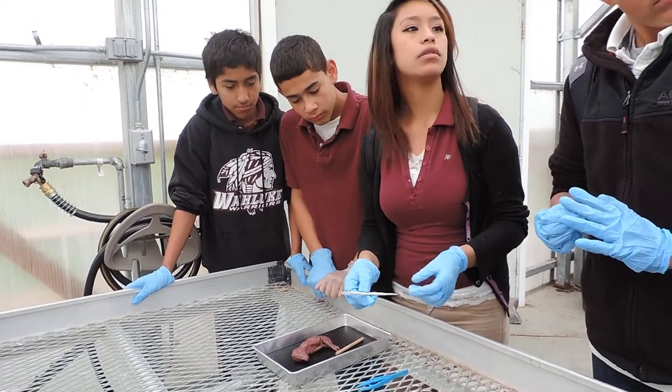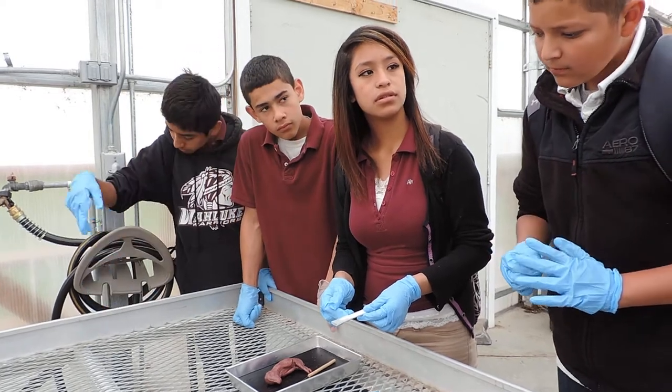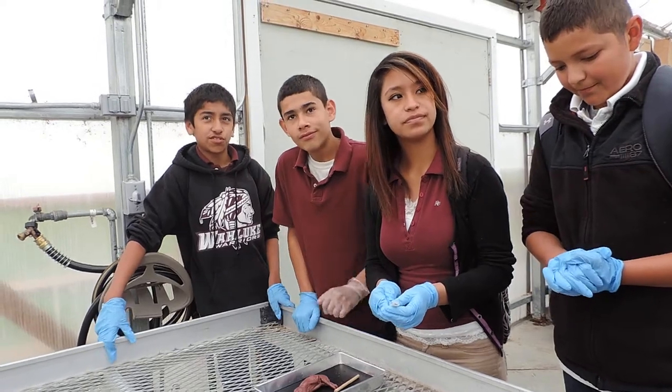You know what I'd like you to do first? Make your initial cuts that we talked about, from here to its ear. What is the structure inside you're going to look for first? Do you remember? Epiglottis. What does the epiglottis do?